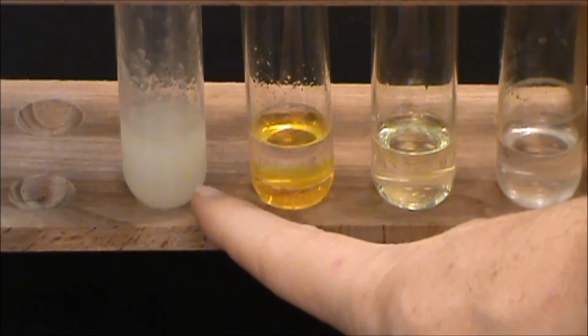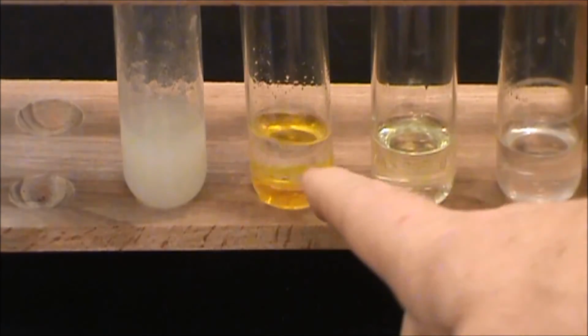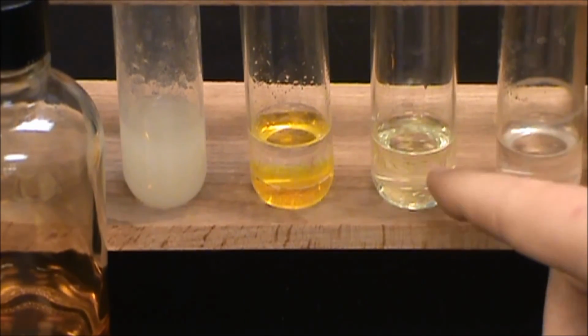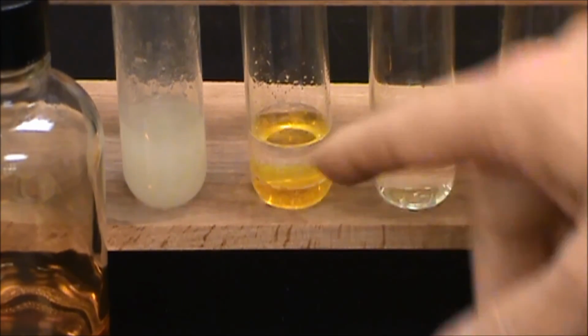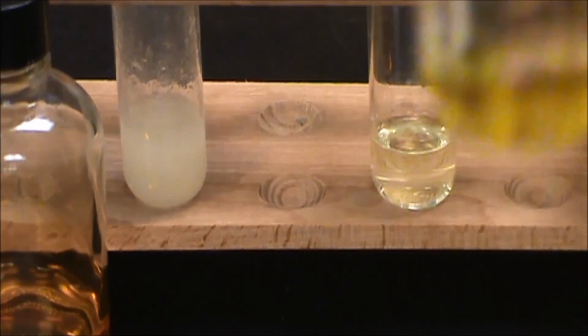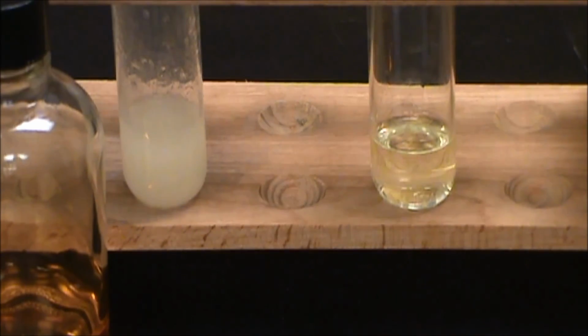So this one here, we can see that it clearly has reacted with the bromine. This one we still have the orange color persisting, so the disappearance of the orange of that bromine is indicating the presence of a double or triple bond. In this case, we can see the comparison between the two substances before and after the bromine addition is quite different. And then here we still have the same layer. Here at an angle, if I can kind of pull this out right, you would actually see a clear layer, and then the orange layer of the bromine is actually on the bottom there. Okay.